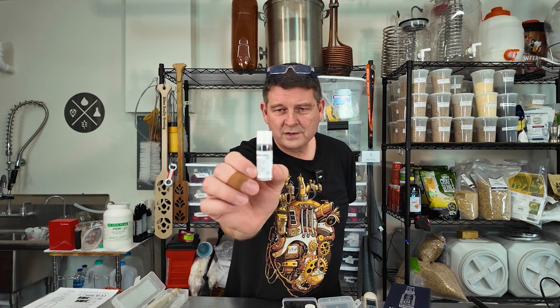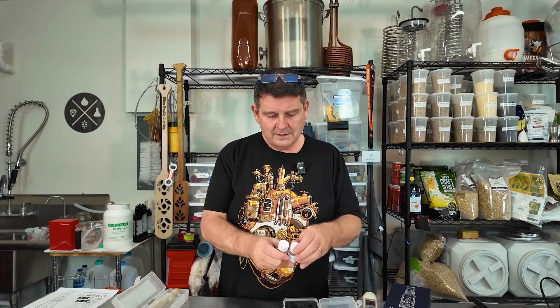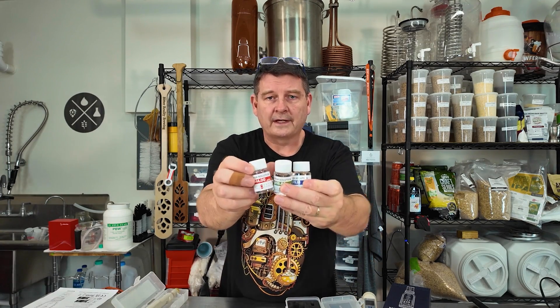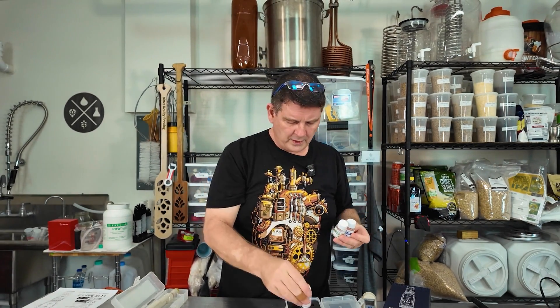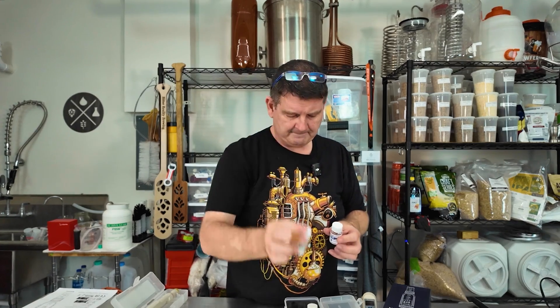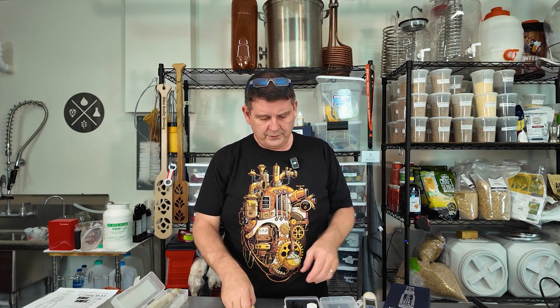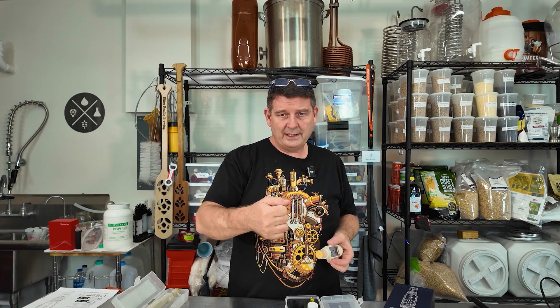This is your storage solution — it comes with it, it's included. I had to buy a big old bottle of that stuff because it did not come with my old meter. That did come with one packet each of the little crystals you had to blend. But this comes with all three vials. You open the vials, you use them, you close them back up and you have them for future use. You have your 4.0, you have your pH 6.86, and you have your pH 9.18. For a later video, we'll do a video on how to calibrate it and go over all the features and settings. From my understanding, I hold one button for a second, and then I literally just take it and it reads each of the three one at a time, and I'm done. It calibrates it, I'm ready to go — rock and roll. That's like super super simple.